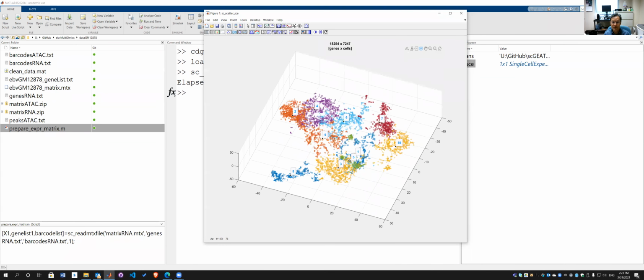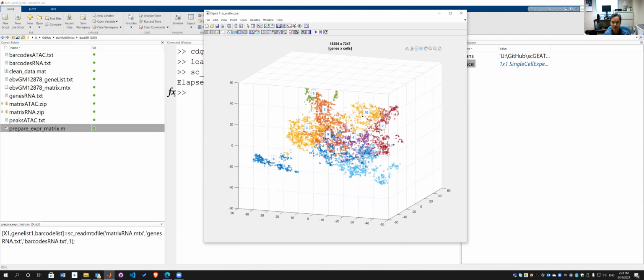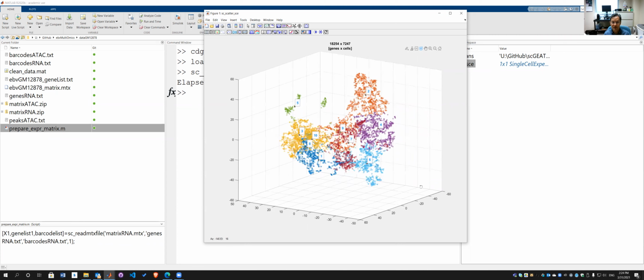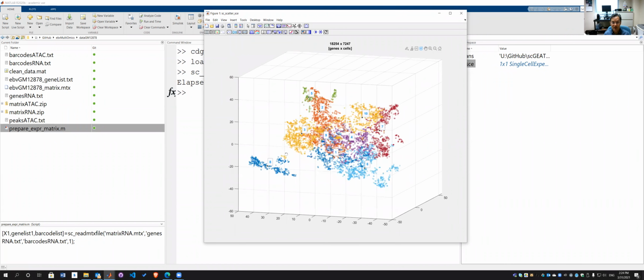And then you start to look at the result of clustering. Basically, it follows the similarity of groups. So you have an island here, and then number 5, something here. Okay. If you are happy with this clustering result, then you don't have to do an adjustment. But in my example, I really think this small group here, can you see there are a couple of yellow or orange cells, I believe should belong to cluster 8. So this automatic k-means clustering algorithm does not give me the best solution I expect to see.